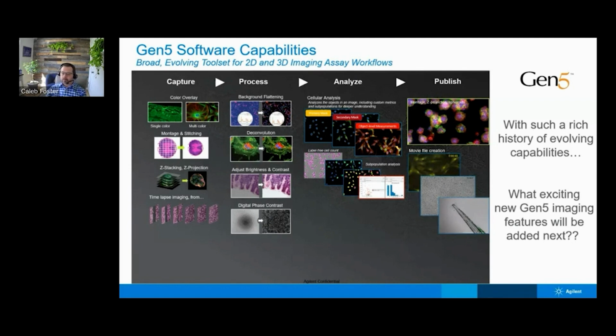What do you see as the most exciting new technologies that will help drive future innovation in the microscopy and image analysis space to address these challenges? Yeah, that's a great one, and it's an exciting time to be alive as a scientist. There are a lot of what I would say are paradigm shifts in our market. I hinted at two of them that I think are really going to revolutionize not just imaging and microscopy, but the scientific community as a whole.